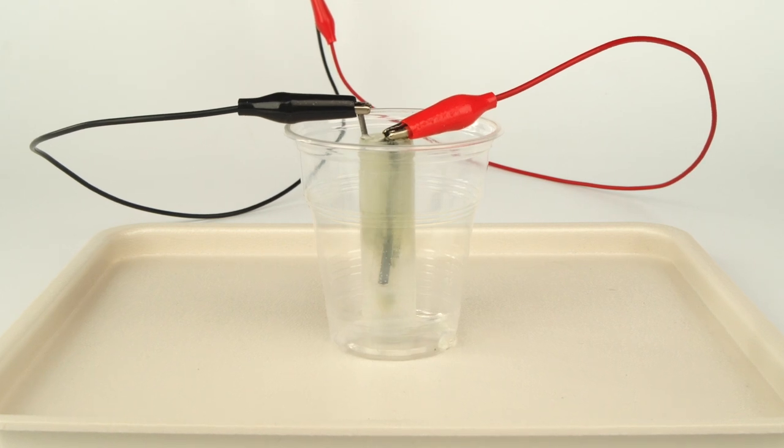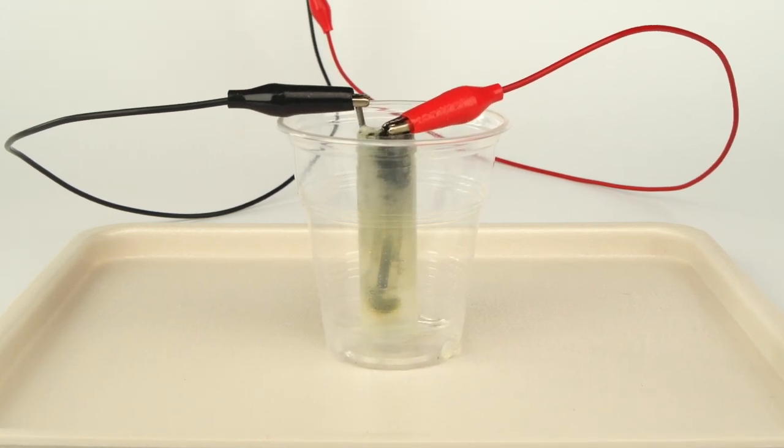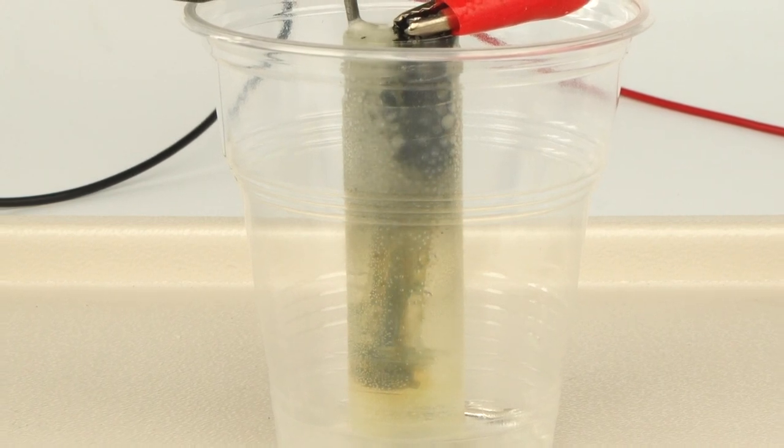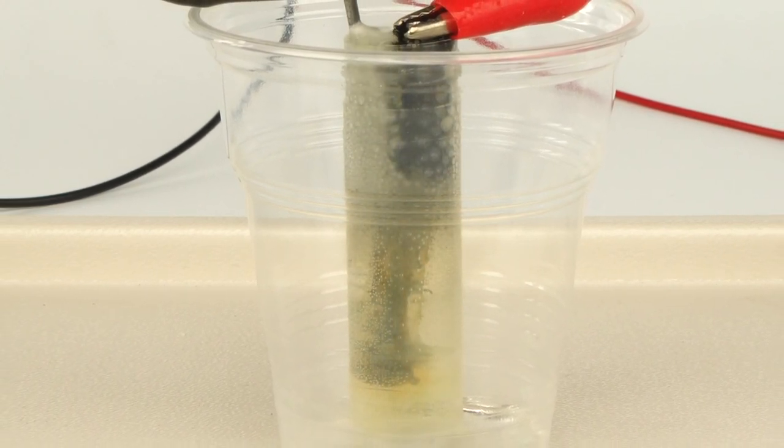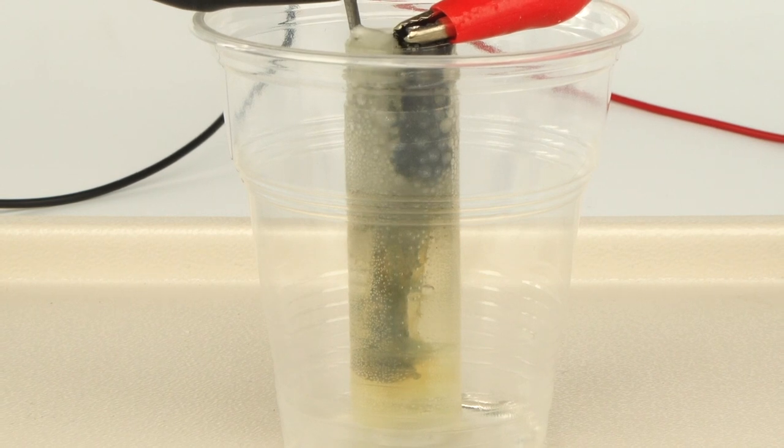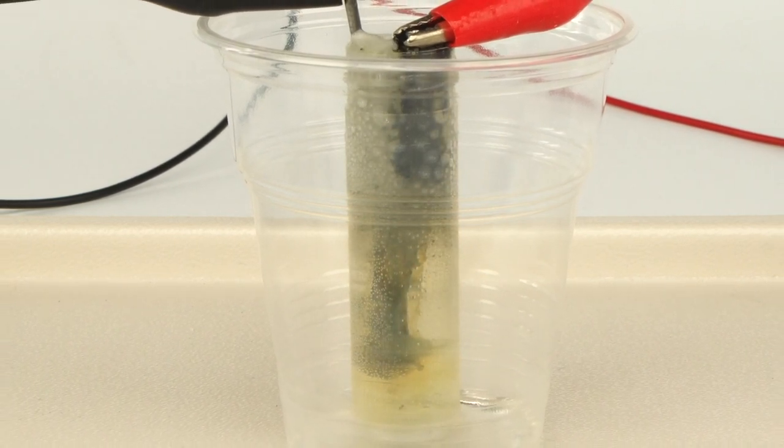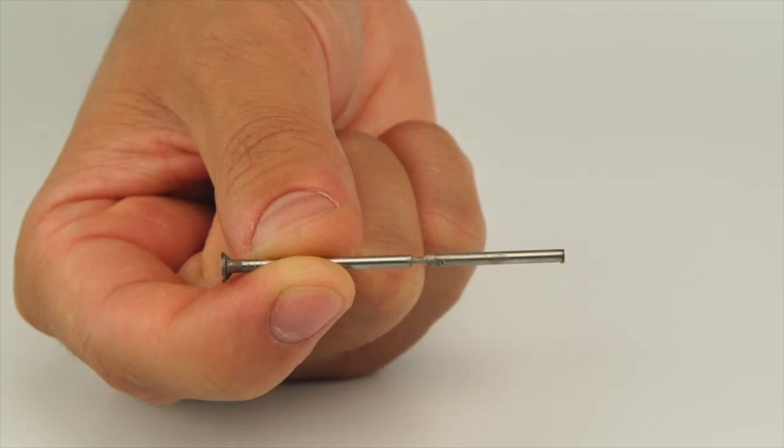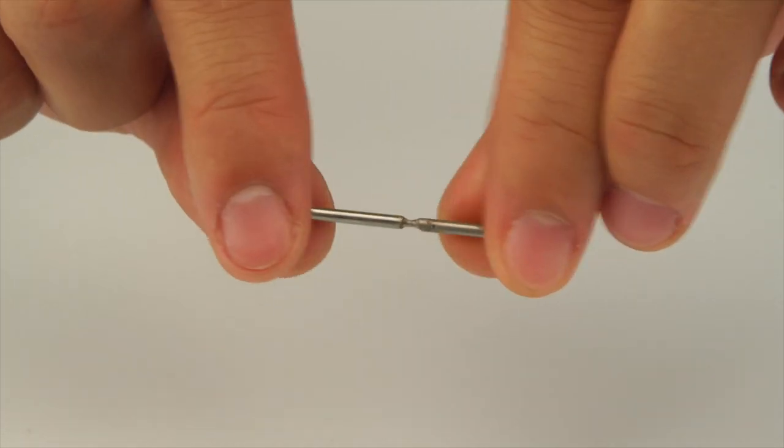Electric current flows through the whole system, through the batteries, the wires, and the nails. The current can even pass through the liquid solution thanks to the salt dissolved in it. The iron atoms in the exposed part of the nail are oxidized and dissolve as iron ions. The nail thins and becomes easier to break.